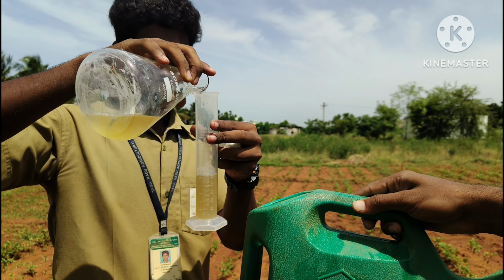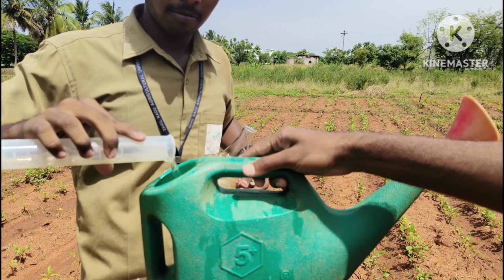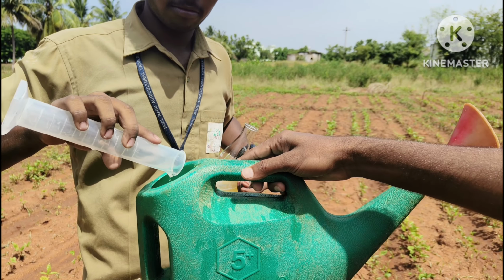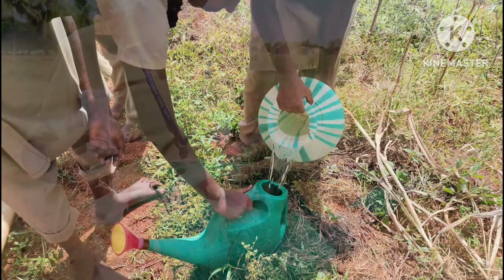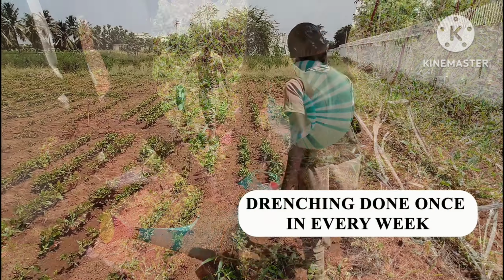50 ml of respective bacterial broths were taken and transferred to a rose can of capacity 5 liters. Water was then added to make up the volume to 5 liters. Drenching was done once every week.